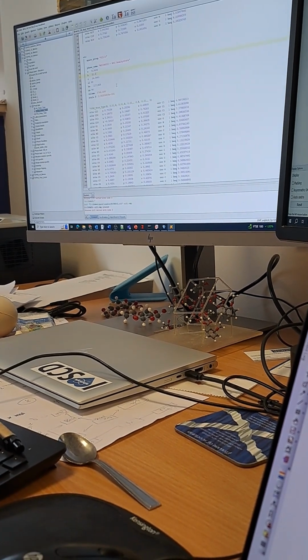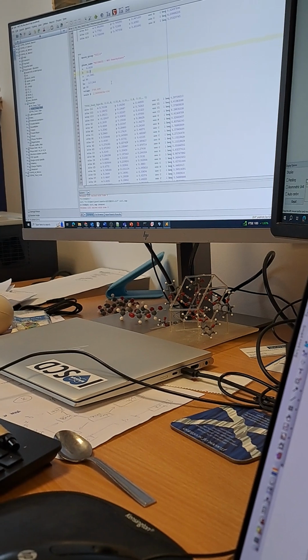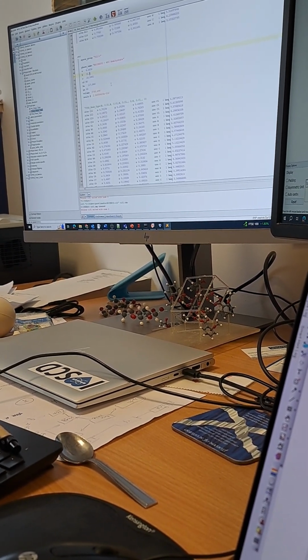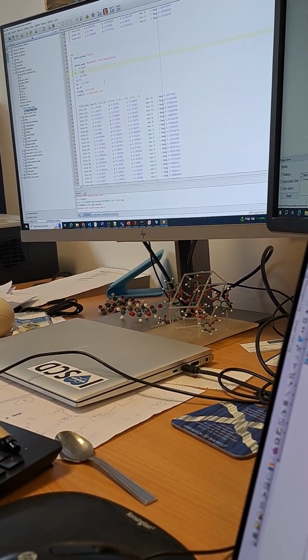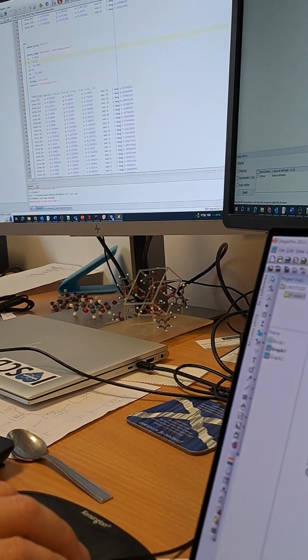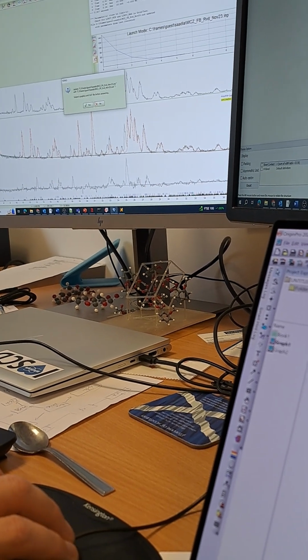Down. No, up. Like we double it. So we don't want to double it, but we're wanting to lower 2 theta, higher D spacing. Okay, so we want to increase our D spacing there. So we can maybe do, say, 31.7, for example. Okay. We go back here, click on that, and we are getting there.